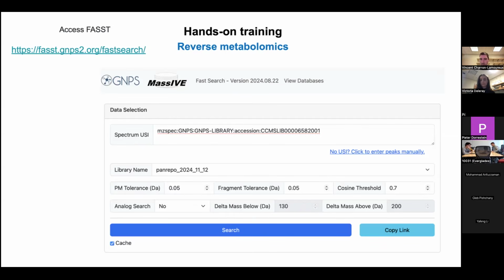I did recently learn there's some other group, and I don't remember where I saw the paper, but they're considering creating a resource for GC-MS like this. Yeah, that would be awesome. I mean, expanding these kinds of tools would certainly help the whole community.